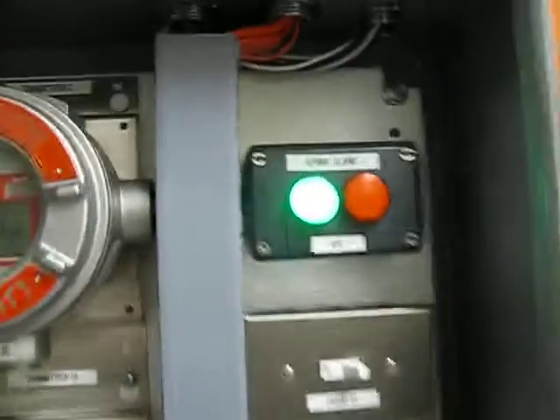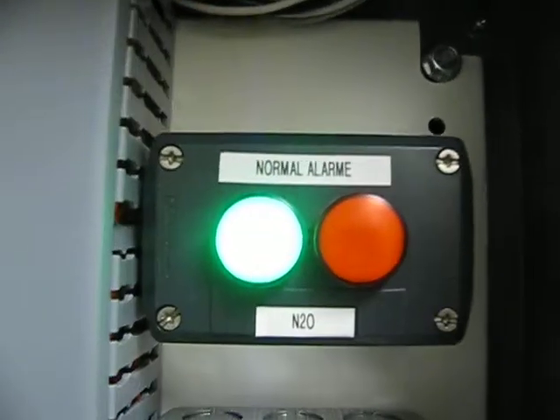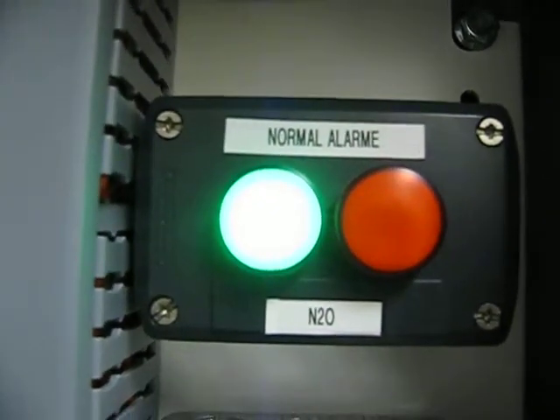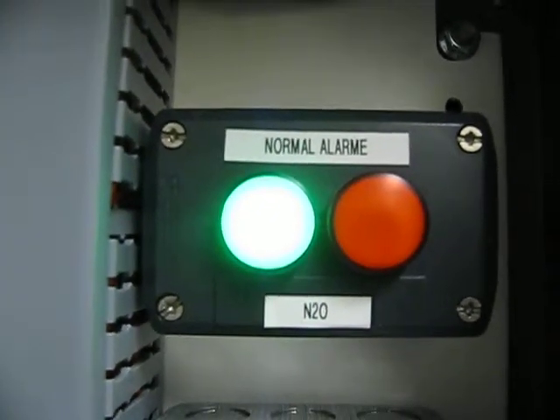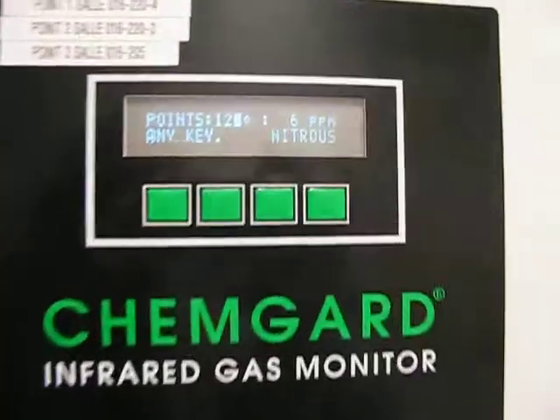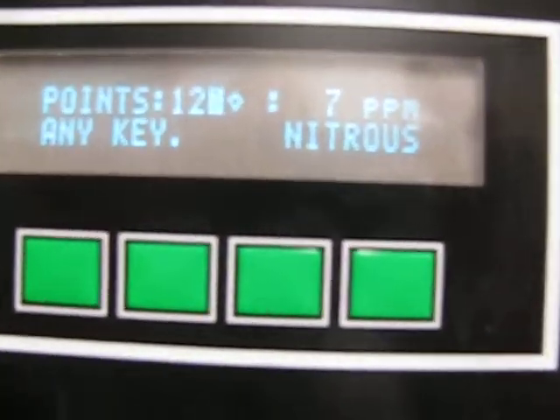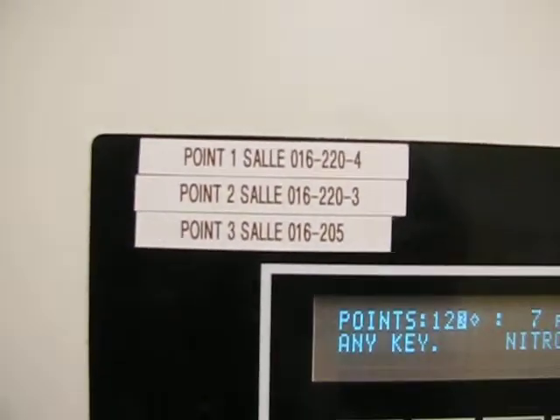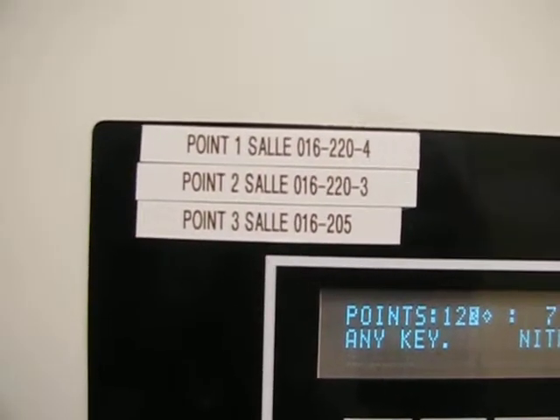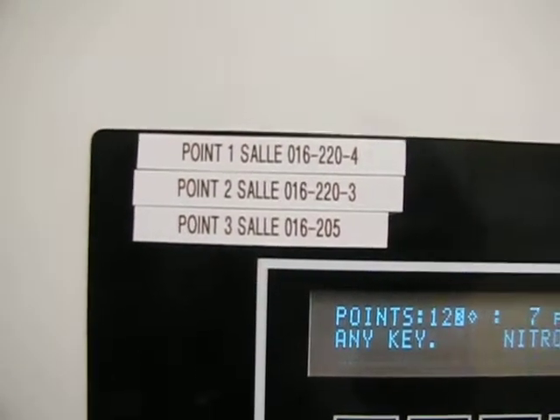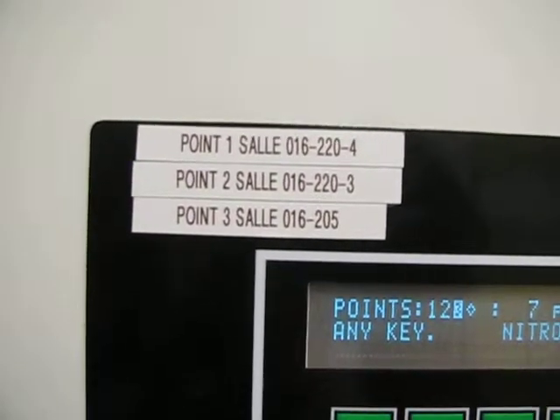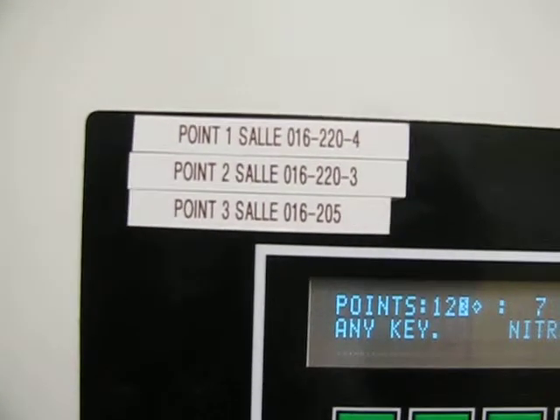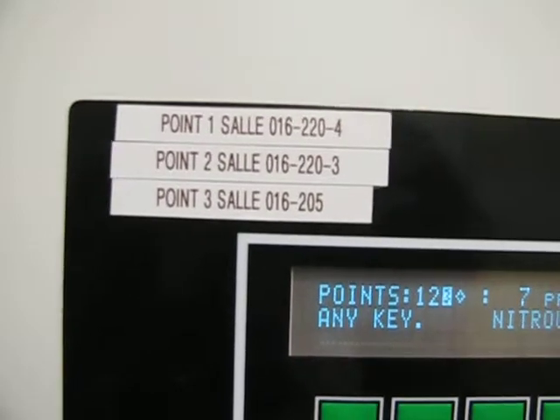Next, we have the alarm for N2O. It is detected in three zones: room 16220-4, room 220-3, and room 16205, which is the gas bubbler.